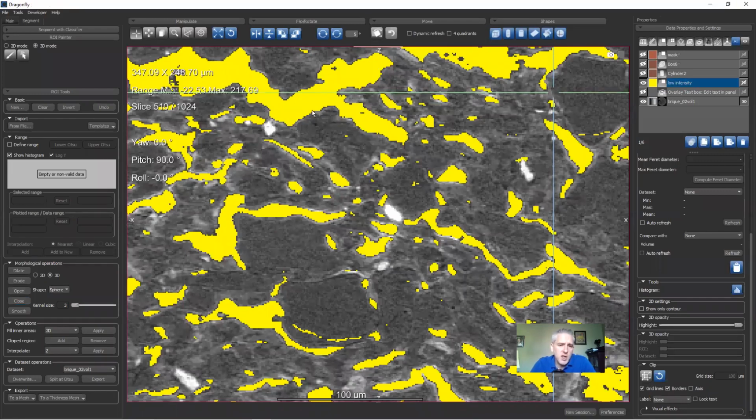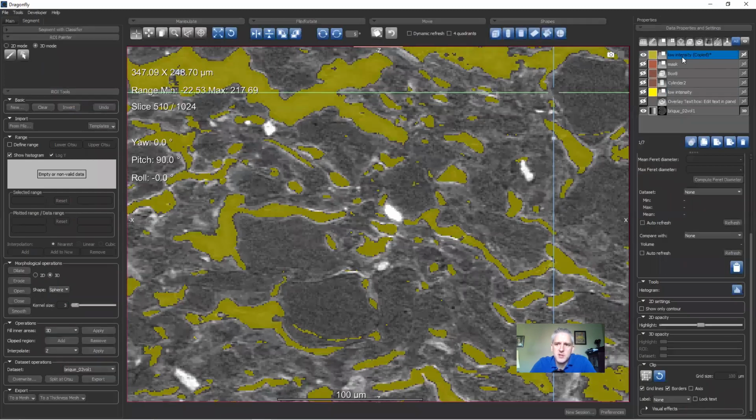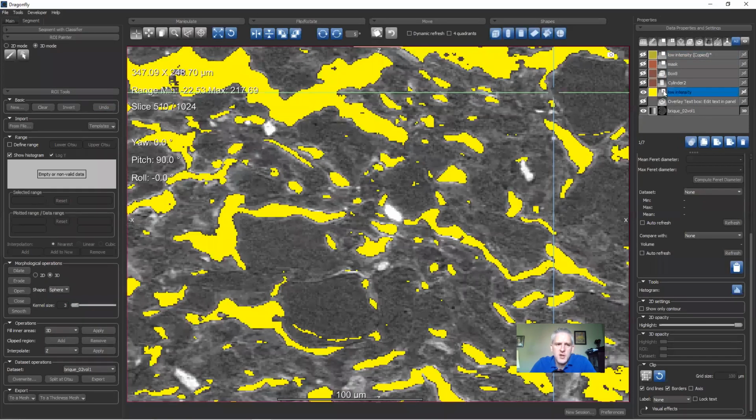So it did close a lot of the holes. I would hit the undo to do a comparison so you could see, but that operation took like 25 seconds. I don't want to have to repeat it again. So actually, let's do this. Let's make a copy of this. And then on the copy, I will undo the operation. Will that work? Let's see. Turn on this, select this, choose undo. No, it doesn't work there. What if I do it on this copy, on the original, and I hit undo? Yeah, so you can see the difference.